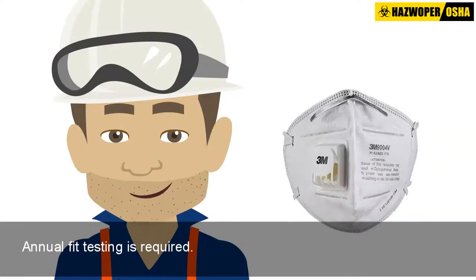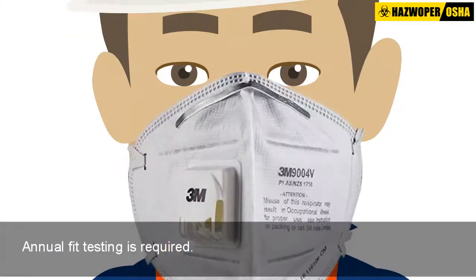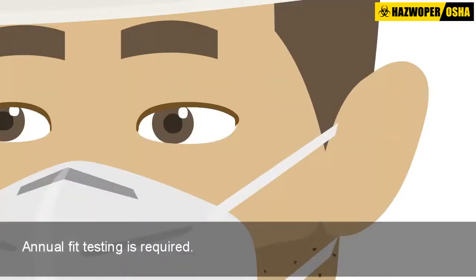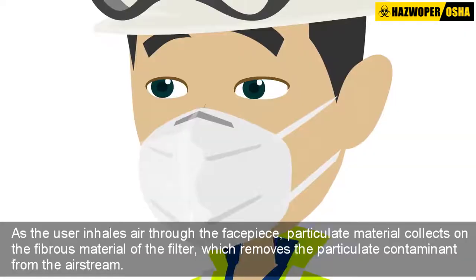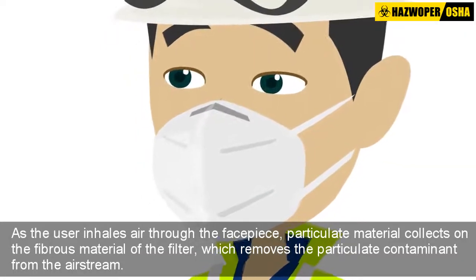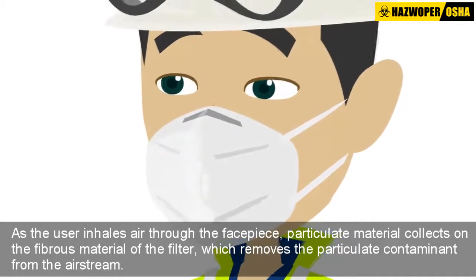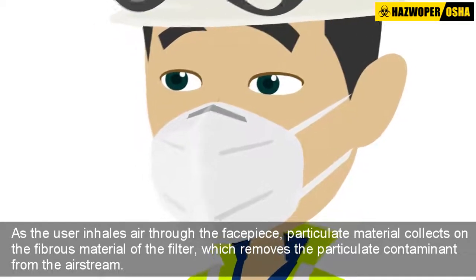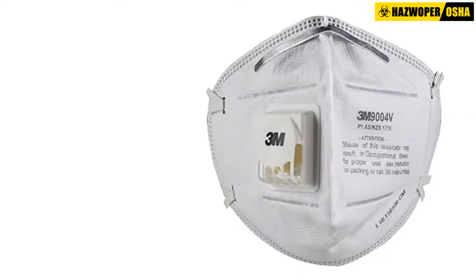Filtering facepiece respirators form a tight seal against the user's face, covering the nose and mouth, and therefore require annual fit testing to ensure the expected level of protection. As the user inhales air through the facepiece, particulate material collects on the fibrous material of the filter, which removes the particulate contaminant from the airstream.